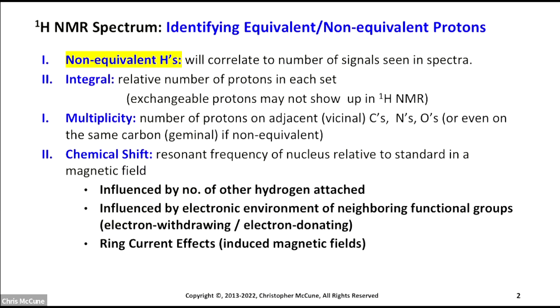All right, so once again, the number of equivalent sets of hydrogens will correlate to the number of signals that you see in the NMR spectra. And that's all we're going to focus on in this video. The other components here, they have their own video as well.